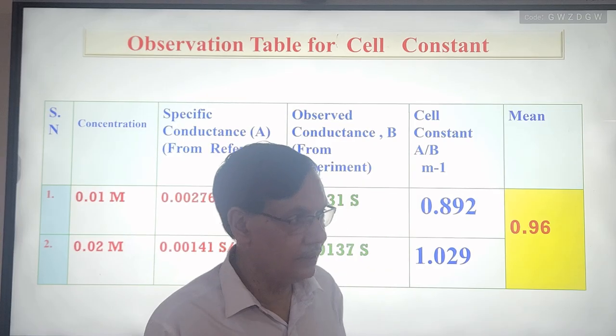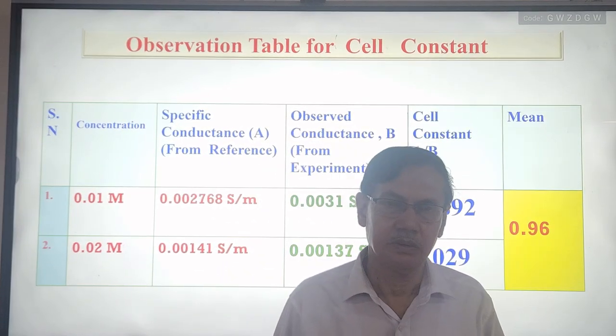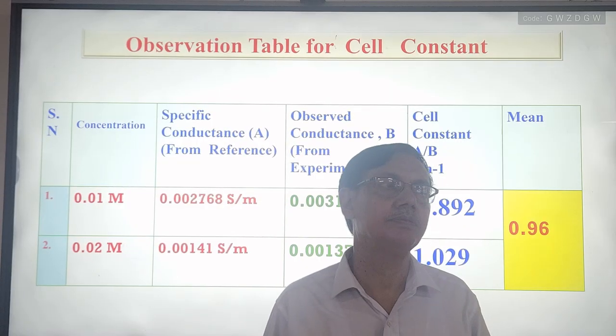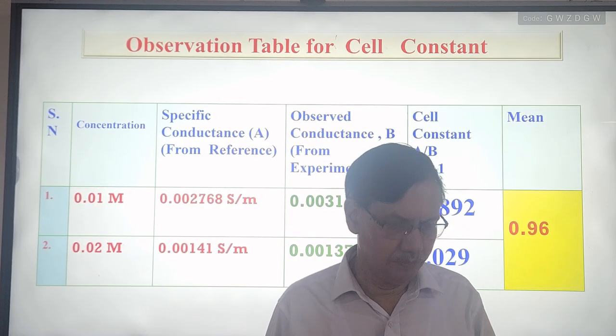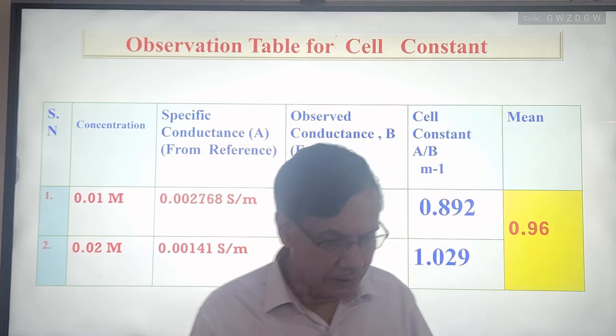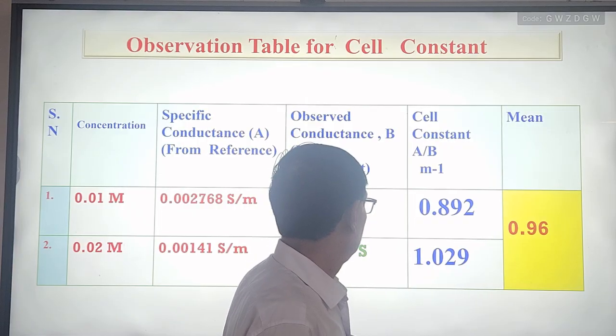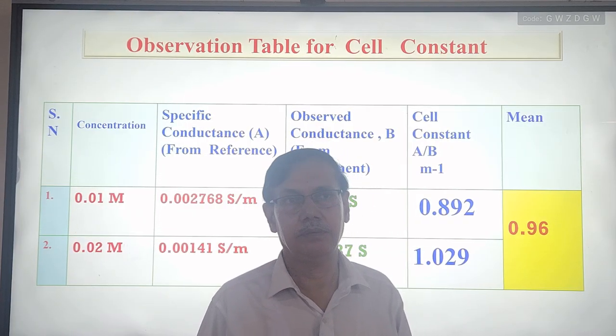I am very happy that you have performed the experiment. And now I got your result. On the basis of your results, I have calculated the cell constant.